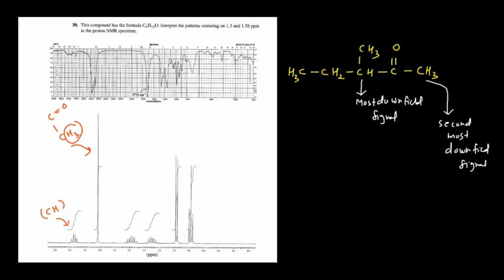And then next one is, you can say, this particular one. This is the beta carbon, and this is also a beta carbon, right? But this would be your third most downfield because the number is 2. You can say this is alpha, this is beta, this is alpha, this is also beta.